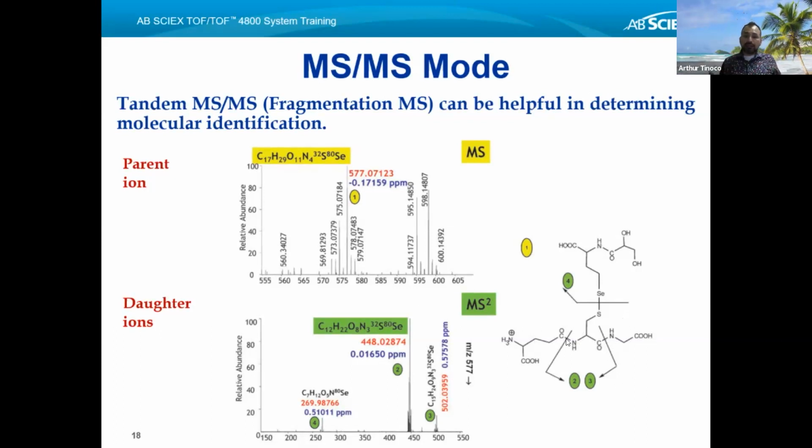All right. So the idea is if you're working with an unknown and you're trying to make sense of what exactly it is, fragmentation can allow you to do this because it gives you the different pieces that when you add them up will give you the whole mass. These different pieces are like pieces of a puzzle that you can put together. As I've mentioned to some people who have worked with mass spectrometry, sometimes you do have to complement this data with, let's say, proton NMR. And all of you in the PR Climb program have had the proton NMR training. So you can get a perspective of how you can couple some of this information with that type of technique in order to identify the molecule of interest.